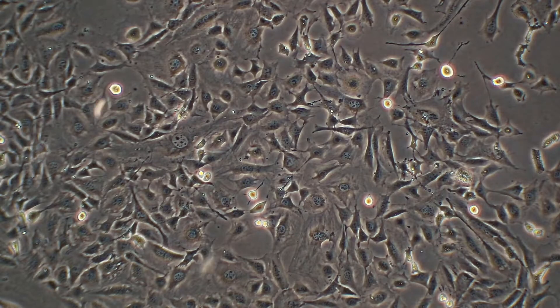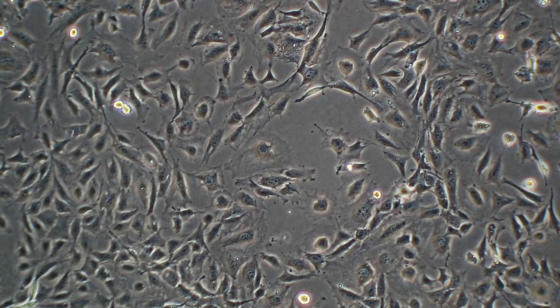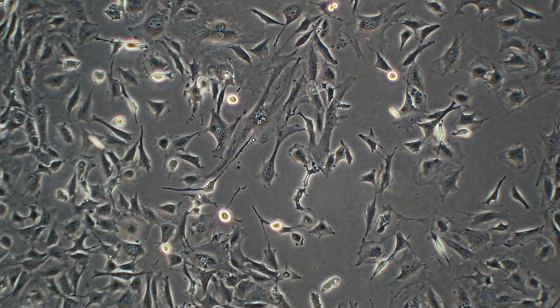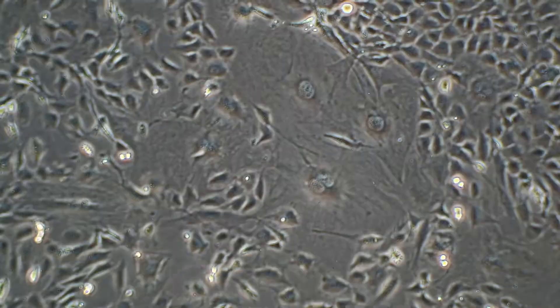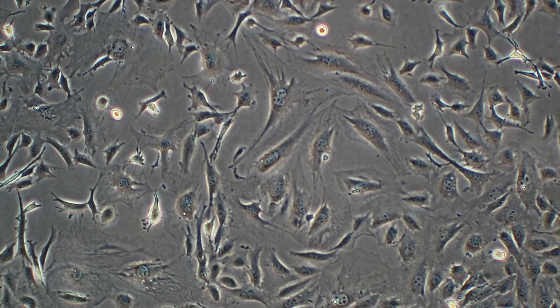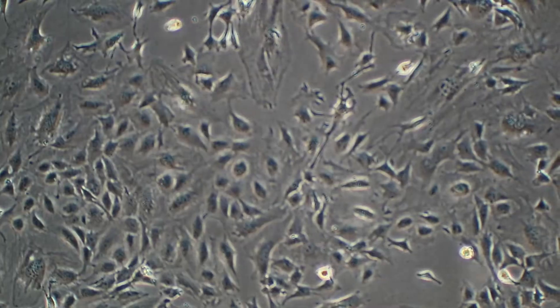Now I'll look at the ones that were centrifuged. This is looking more like a good time to passage — there is some space in between cells. This is where you might call 80 to 90% confluency.